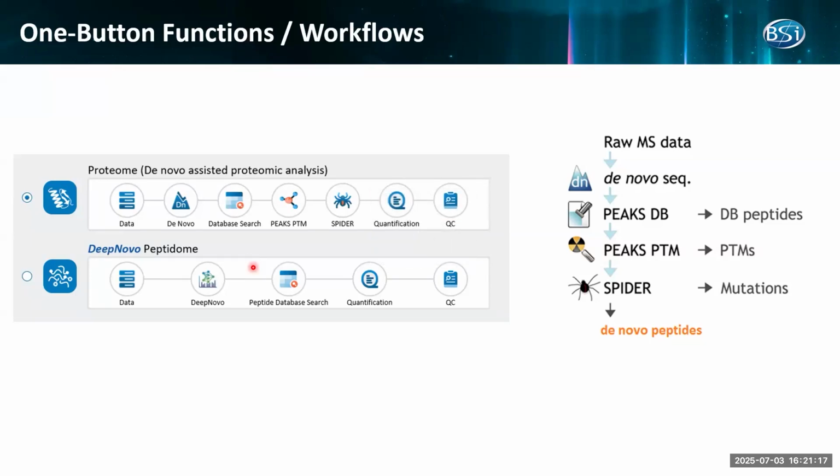If they exactly match the sequence, this is a database peptide. If it's a sequence variant, or a new peptide, they share some tag with a protein or a few proteins. For example, one peptide's N-terminal segment may share with some part of a protein, and the C-terminal may share with another part of some other protein.